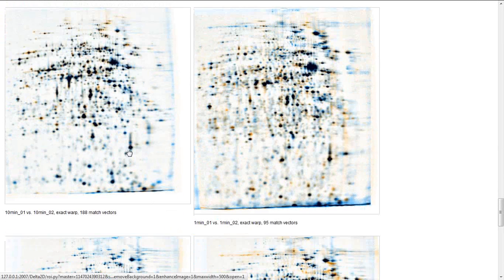And this report can now also be used not only for reporting but also for quality control. For example, after the image warping step, which you might have delegated to another colleague, you tell them, before going to the next step and fusing the images, let's have a look into this report, and then you say, okay, in a certain region, maybe improve the warping here or there, and afterwards let's continue with the image fusion.